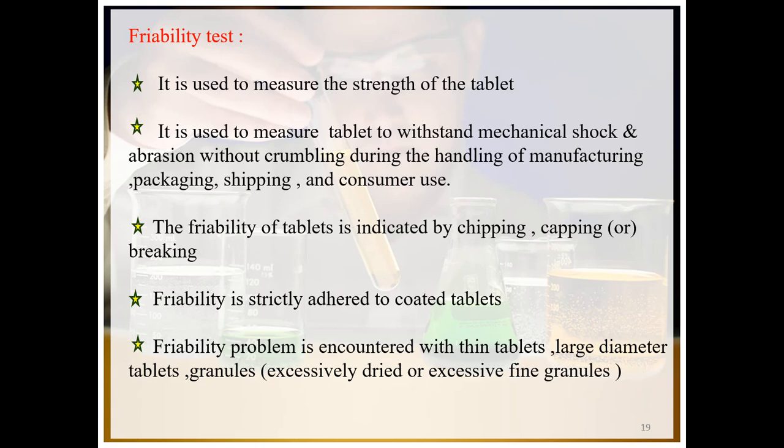Let's start with the friability test. This is another official test which is performed for tablets. The friability test is usually used to measure the strength of the tablets. Why is the friability test performed? This test is performed to measure the ability of tablets to withstand mechanical shock and abrasion without crumbling during the handling of manufacturing, packaging, shipping, and consumer use.